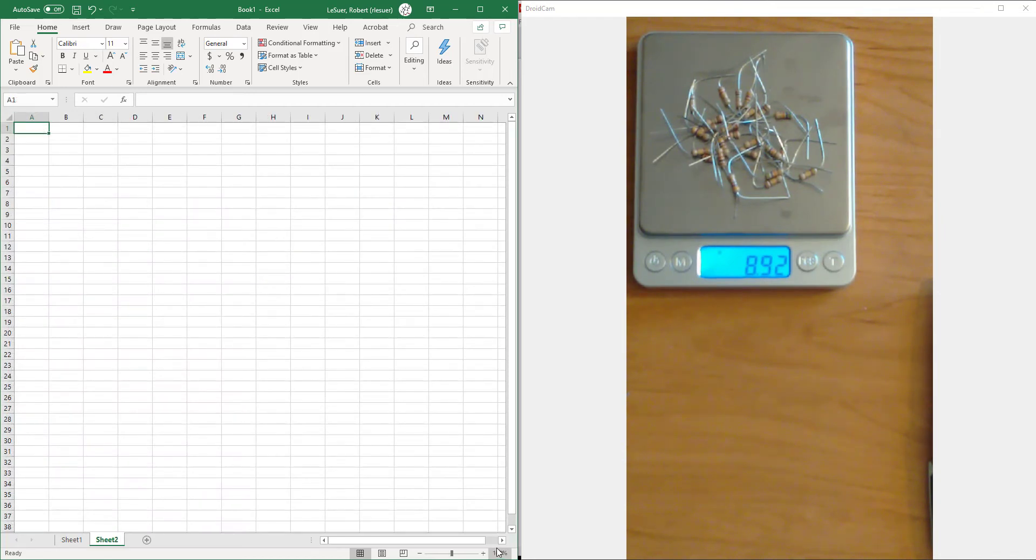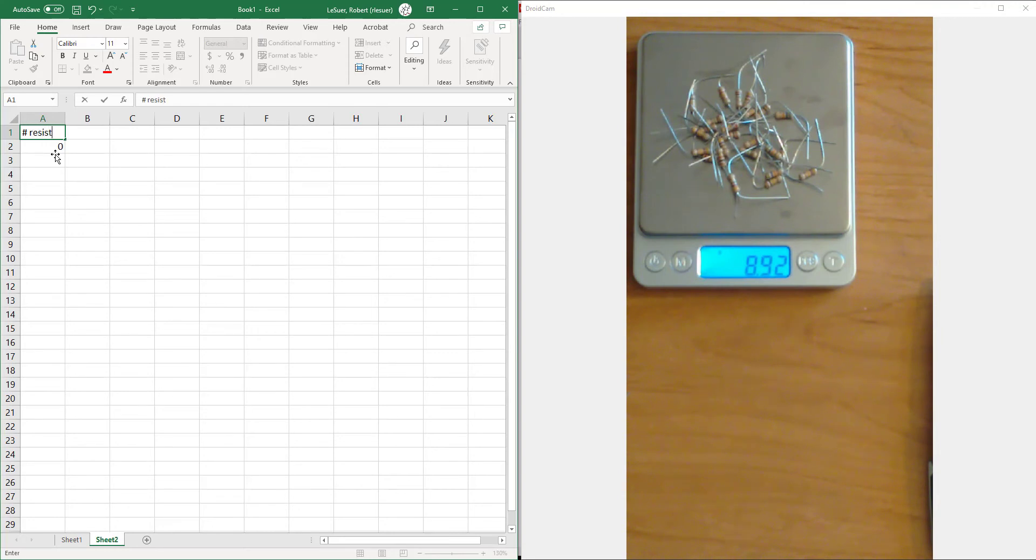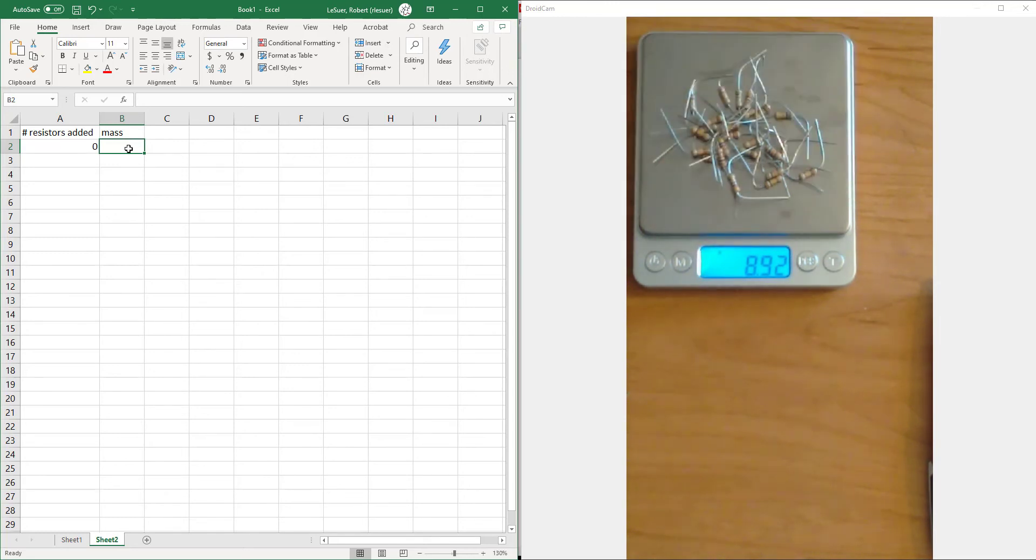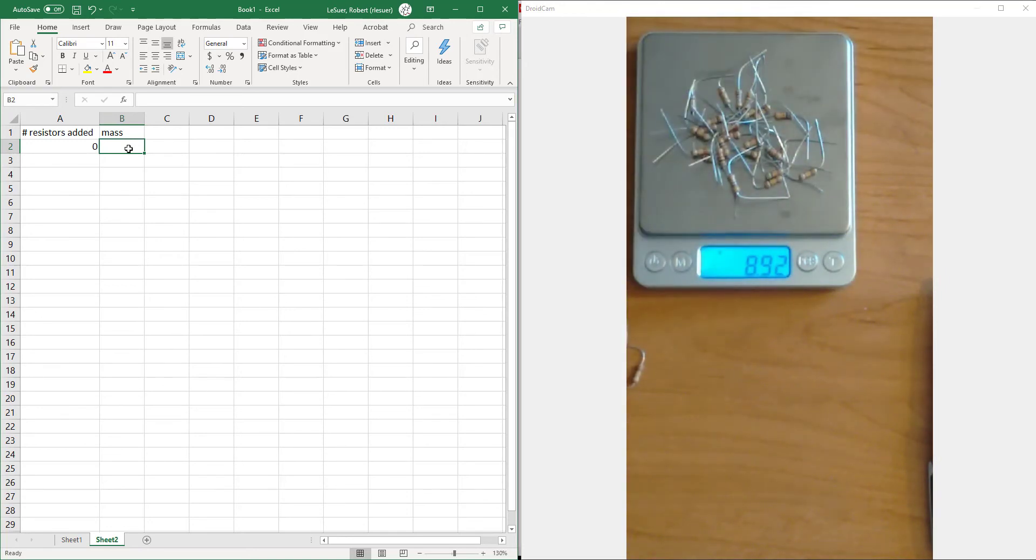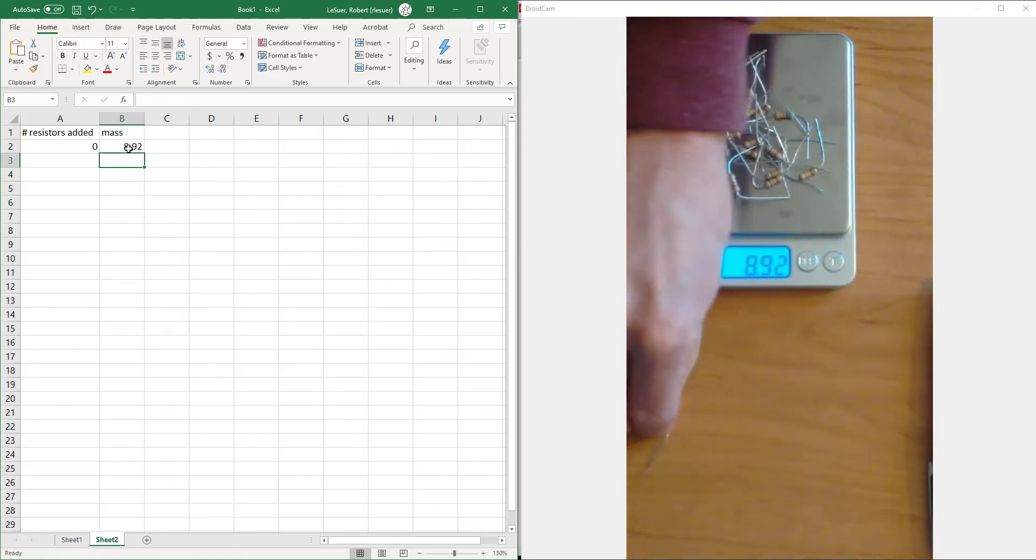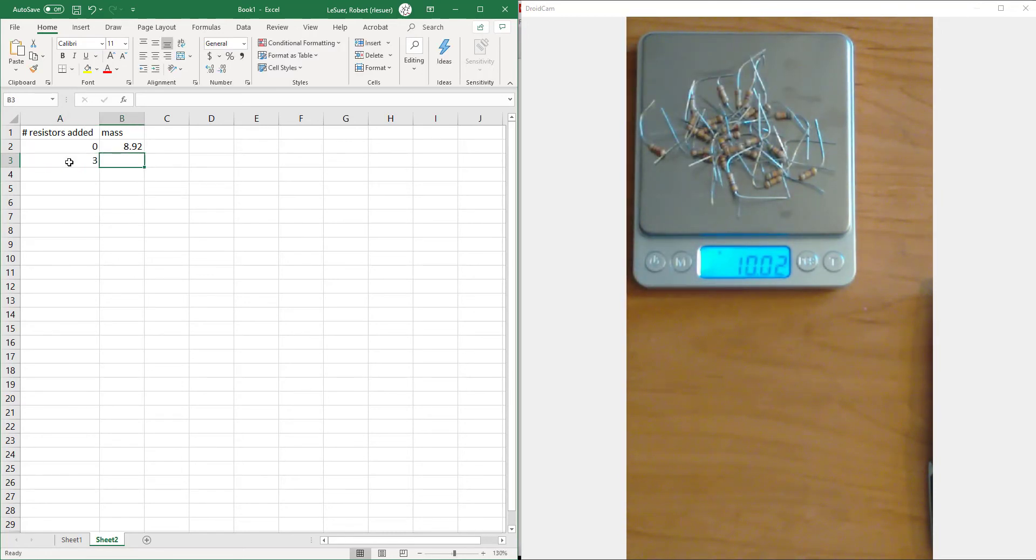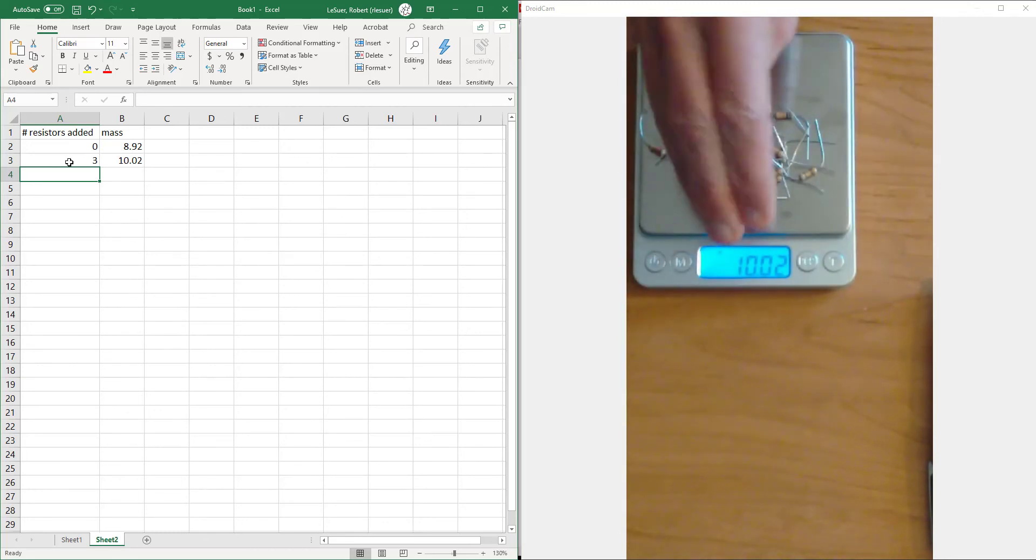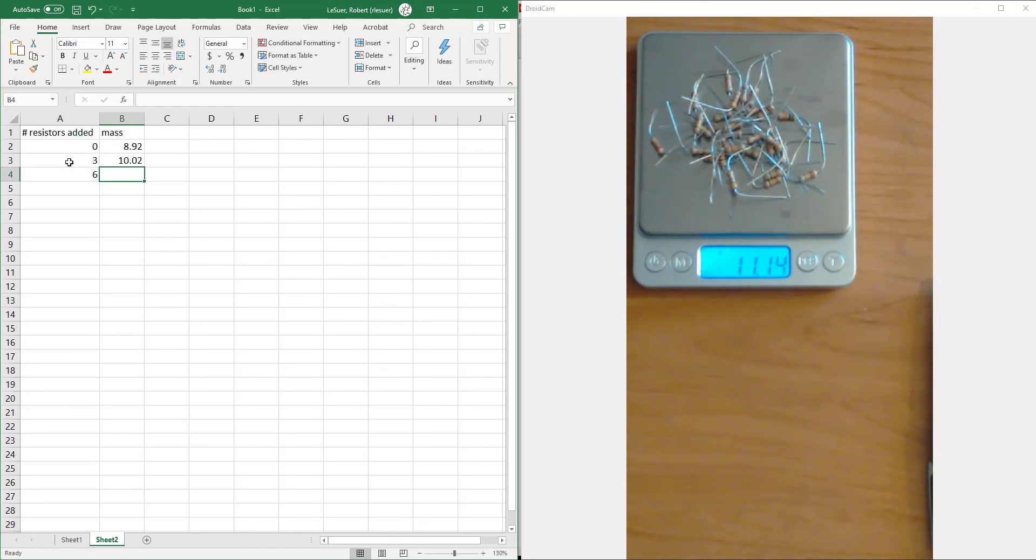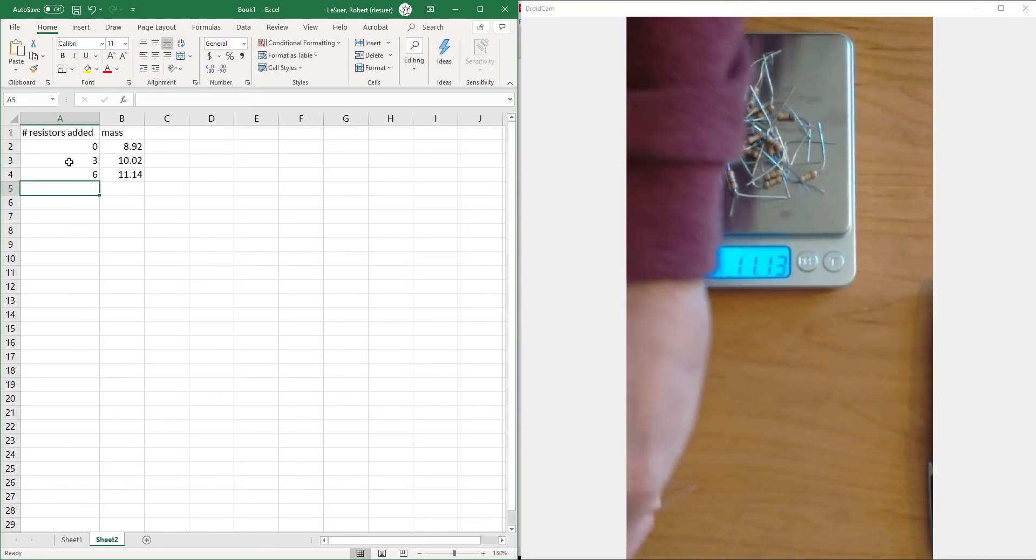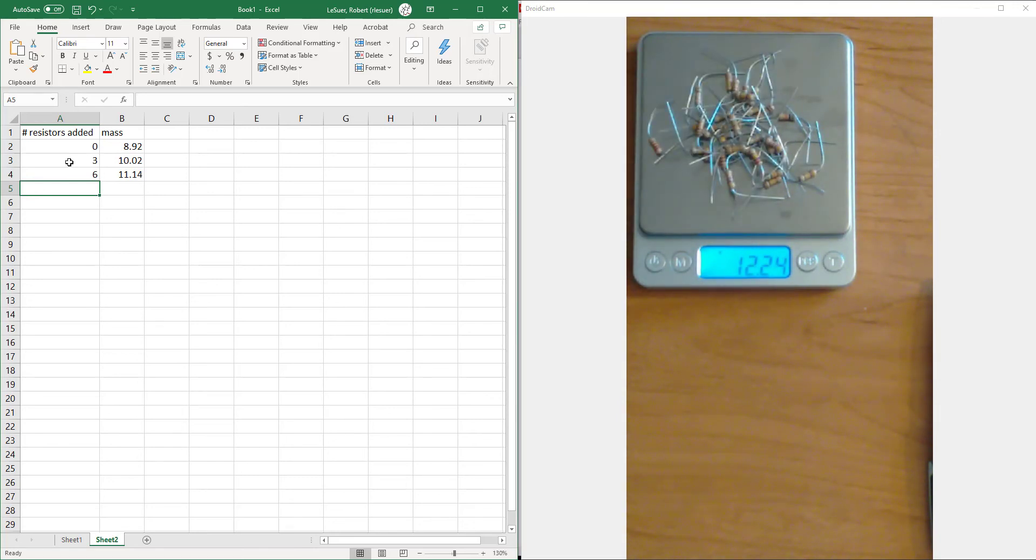The way we're going to do that is something called the method of standard addition. We're going to use the same approach, only now instead of starting with an empty balance, we're going to call this x column the number of resistors added. We start off with zero resistors - I've got a pile of resistors here and I'm going to add more to it. Starting with no added resistors, the mass is 8.92 grams. Now when I add three resistors, that raises to 10.02. I'll add another three resistors for a total of six. And one more time, three resistors. We're at a total of nine resistors and 12.24.